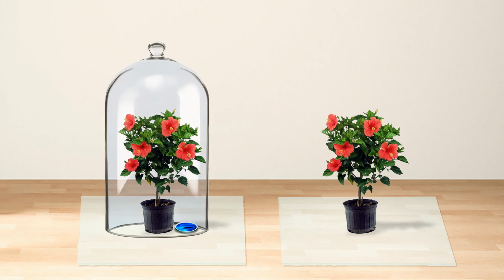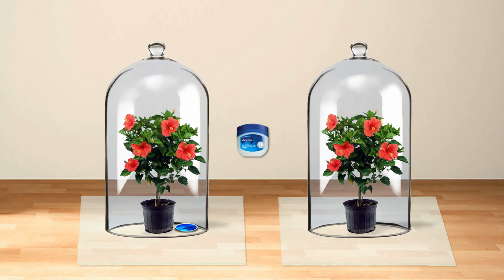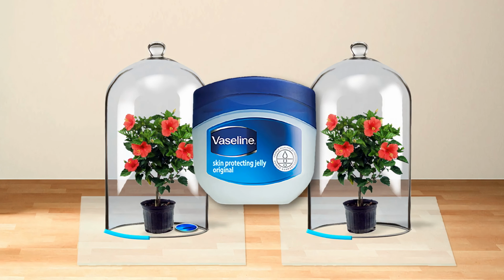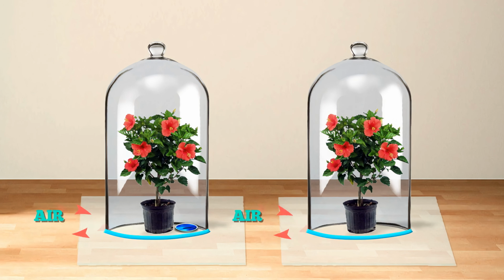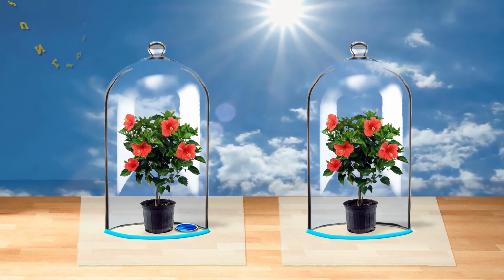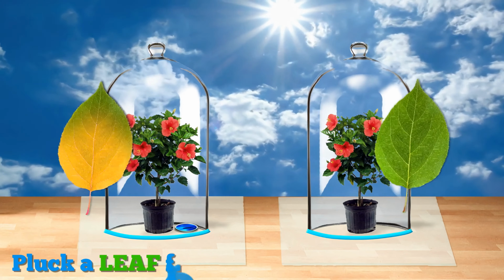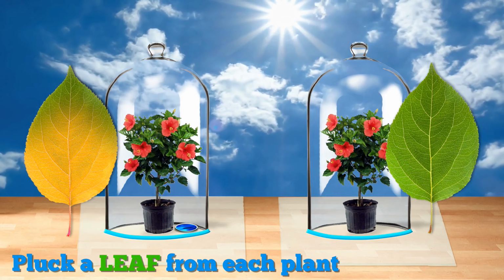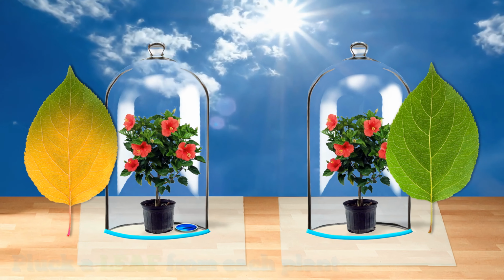Cover both plants with separate bell jars. Use Vaseline to seal the bottom of the jars to the glass plates so that the setup is airtight. Keep the plants in sunlight for about 2 hours. Pluck a leaf from each plant and check for the presence of starch as in the above activity.